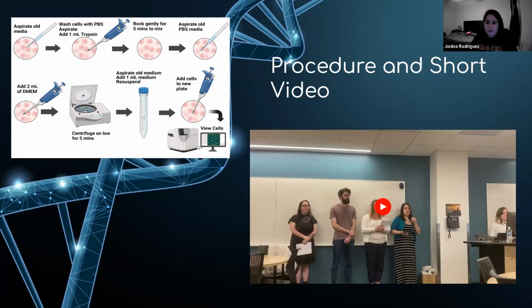What we did is we basically just rocked the cells back and forth in the hood, which was just moving them so that you can mix the trypsin all around. And then once that is done, you just want to keep it going.